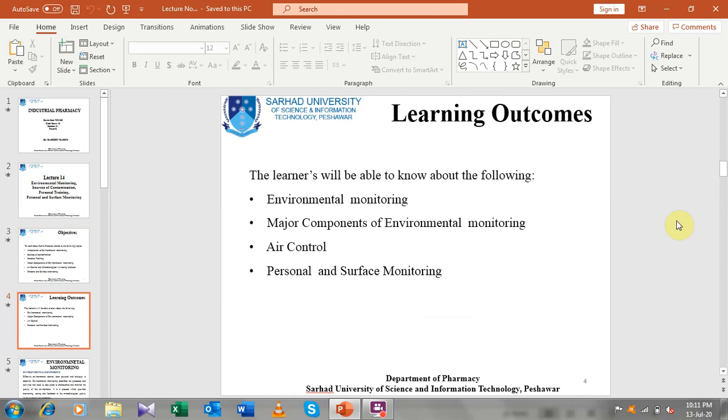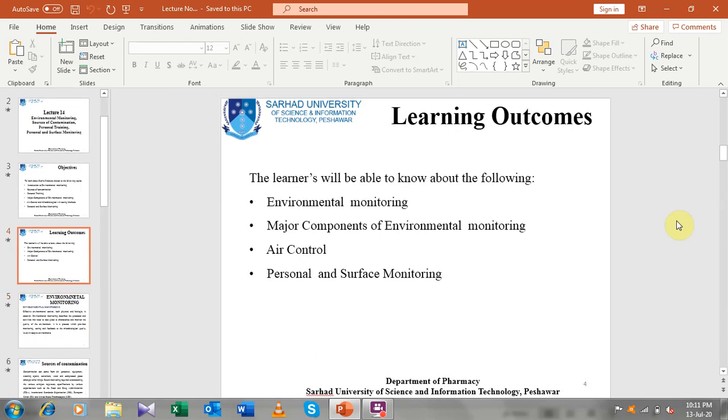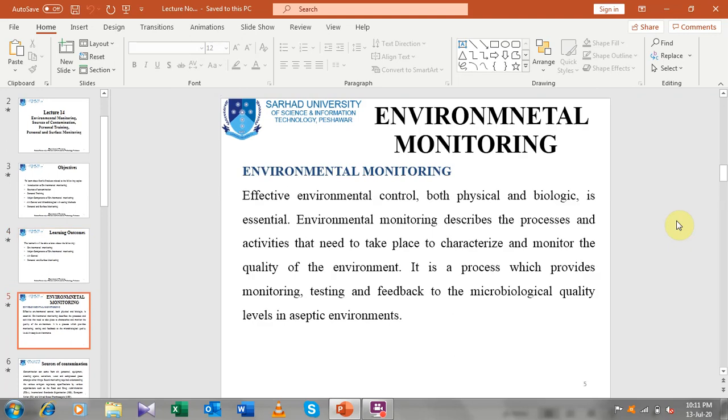Dear students, after the completion of this lecture, you will be able to know about environmental monitoring, the major components of environmental monitoring, air control, the different testing methods for air control, microbiological testing of the air, and personnel and surface monitoring in the pharmaceutical industry. But our focus will be on the sterile area as well.